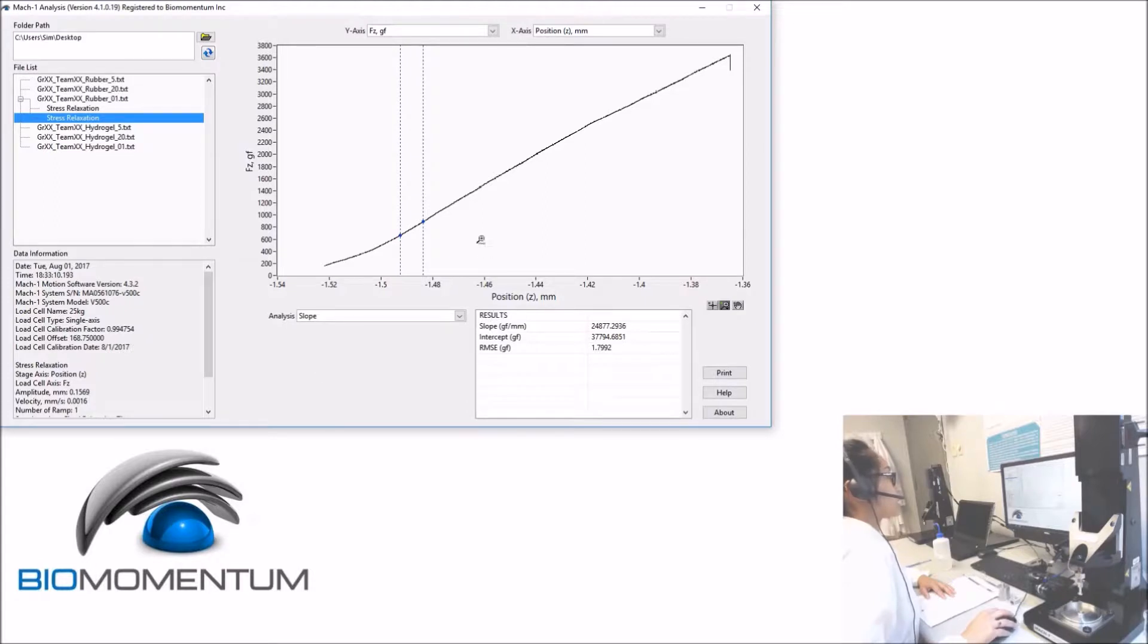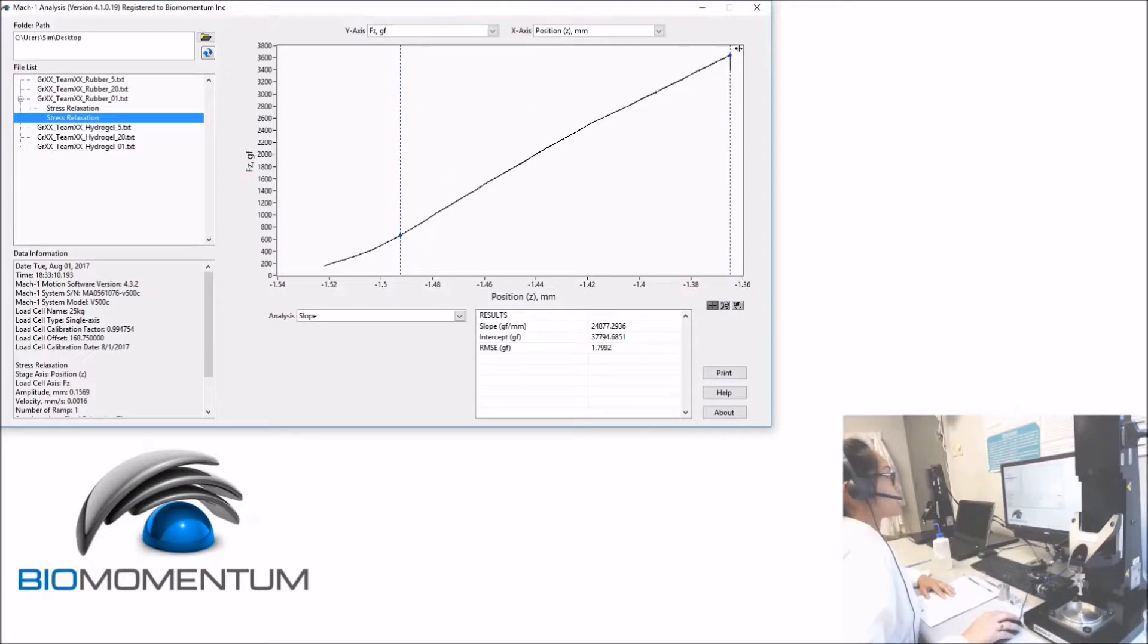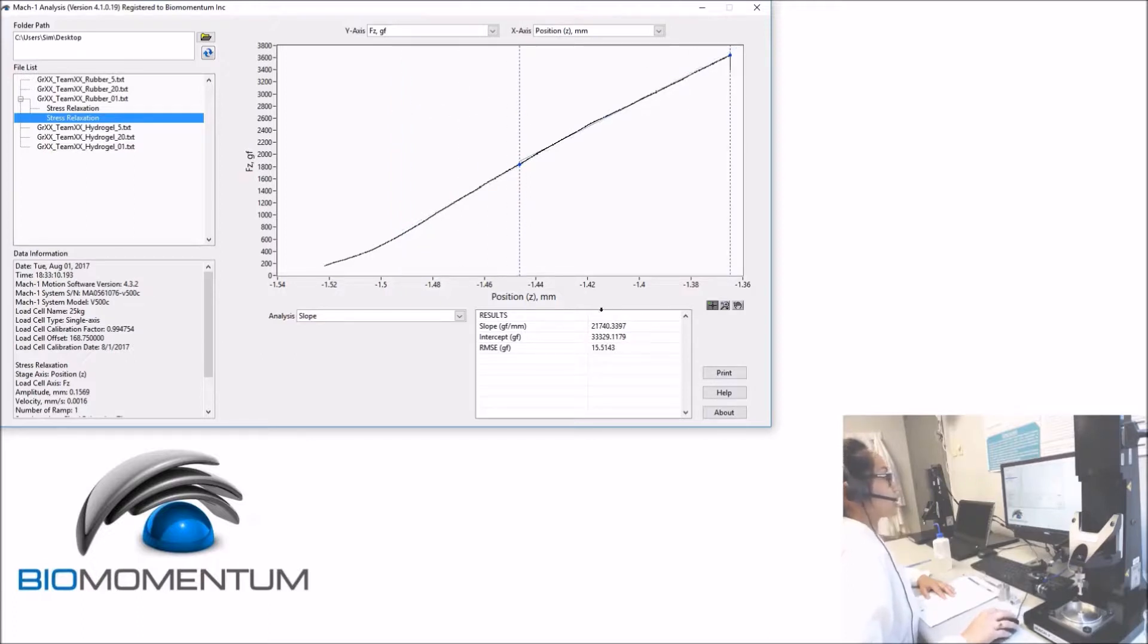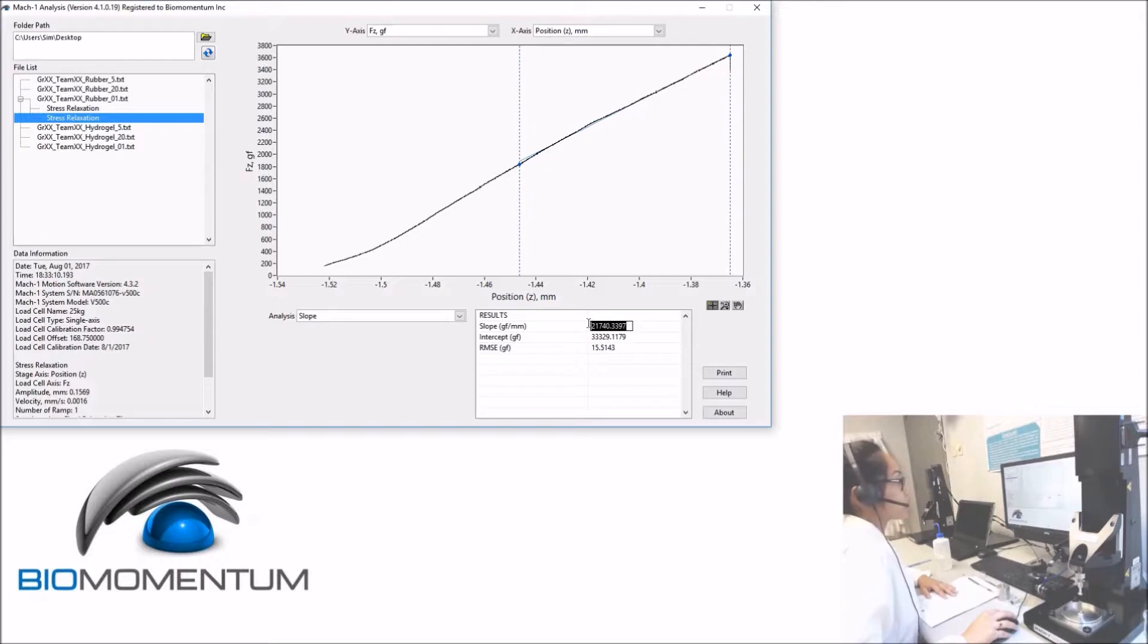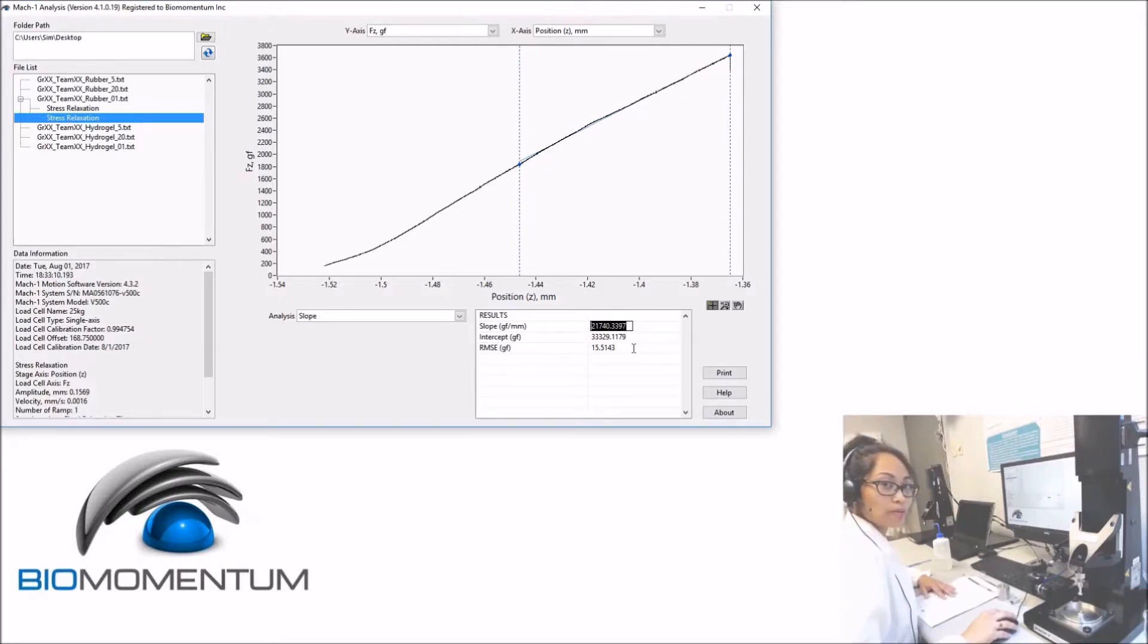As we are analyzing the last 50% of the slope, we will position the cursors as so. The calculated slope corresponds to the stiffness of the rubber sample, in this case, 21,740 gram force per mm.